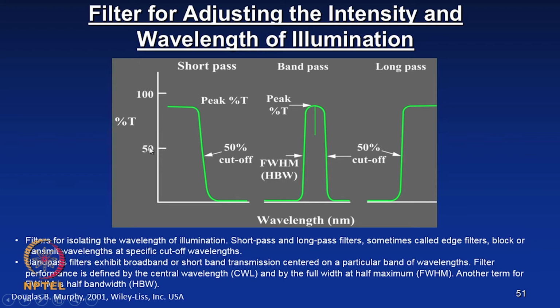You can see that it is 50% cutoff, it is peak transmission, and the band pass filters exhibit broadband or short band transmission centered on a particular band of wavelength.